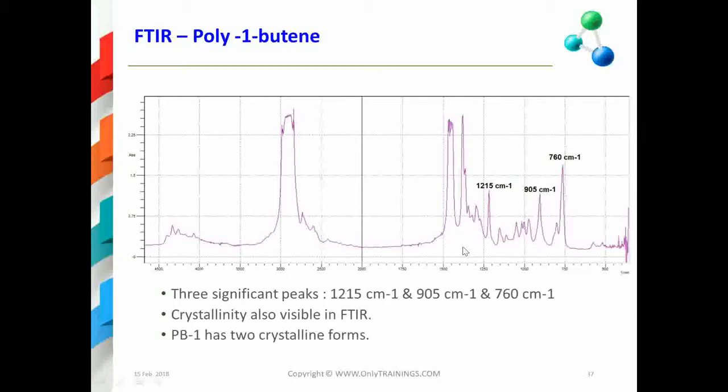But this may be also interesting. If you have a material which is interesting, you can make different graphs and you can compare it and you can learn from it. But even so, I wanted to do something more in order to get more information.